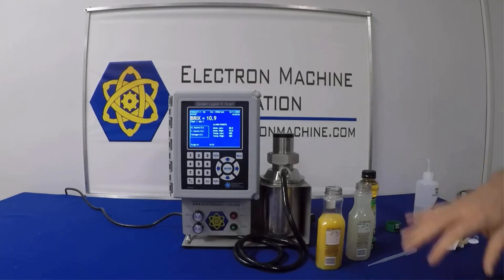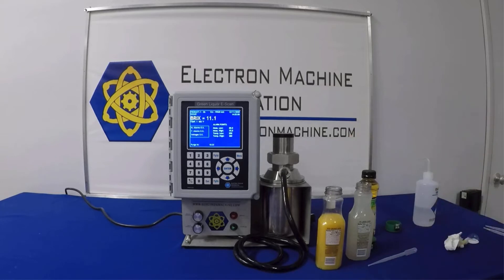Now I've placed the lemonade sample on and we're letting it stabilize. It looks like it's coming in at around 11 Brix. So the lemonade is actually a little bit sweeter than the orange juice in this case.